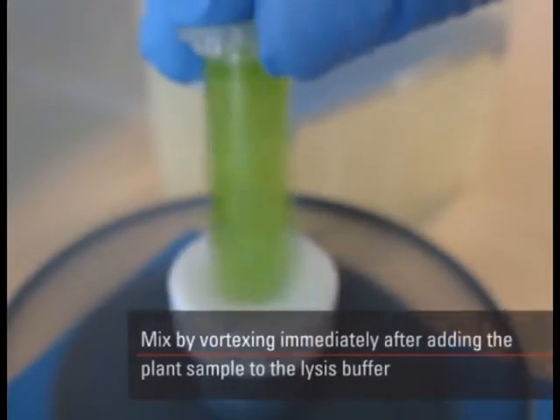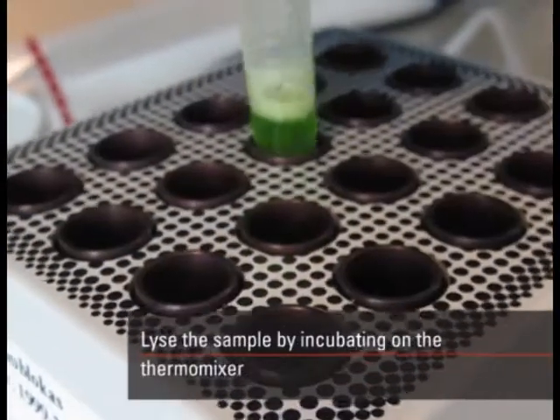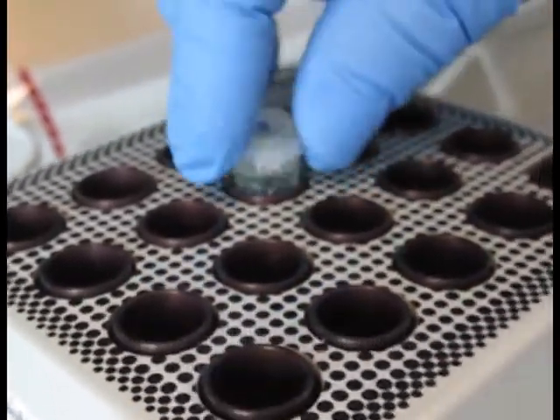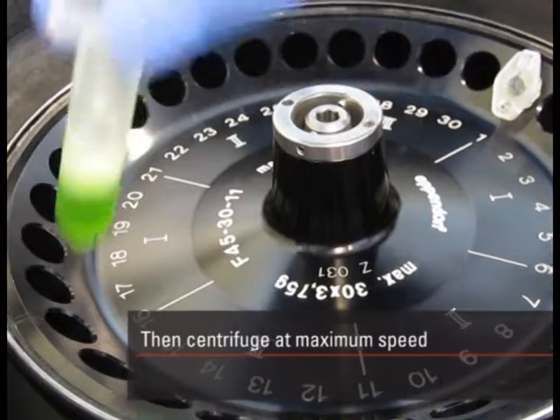Mix by vortexing immediately after adding the plant sample to the lysis buffer, and lyse the sample by incubating on the thermomixer. Then centrifuge at maximum speed.